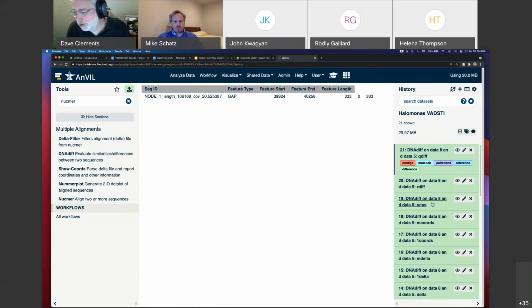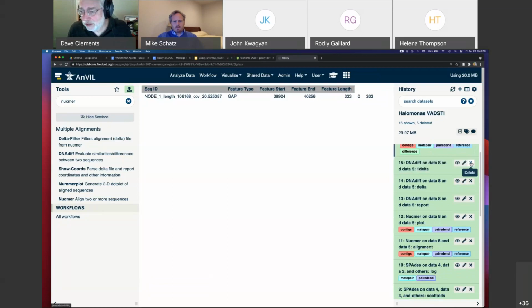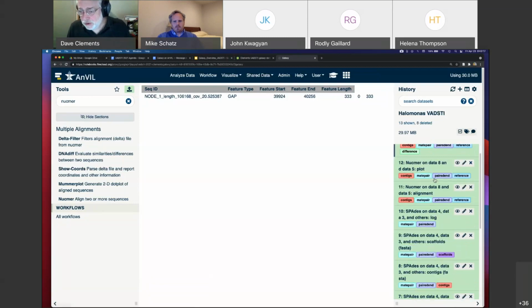Something else I want to do, again, if I didn't know what was happening, I would look at all these, but right now they're just noise. So I'm going to delete them. Delete, delete, delete, delete, delete. And that'll keep my history cleaner and more tractable in my brain. Okay, and that one. So that's great.